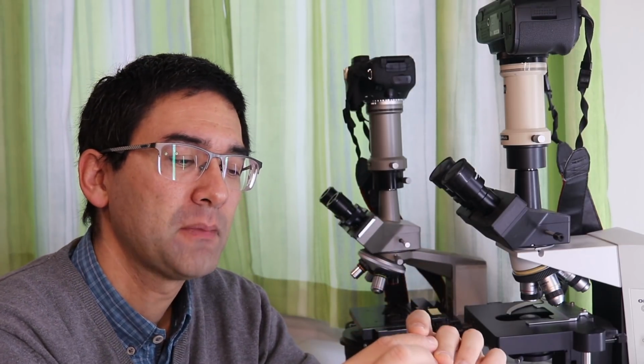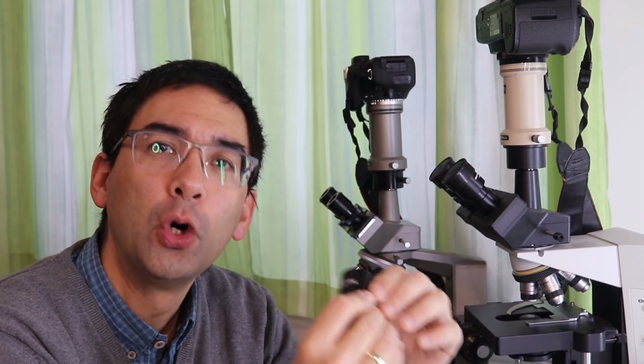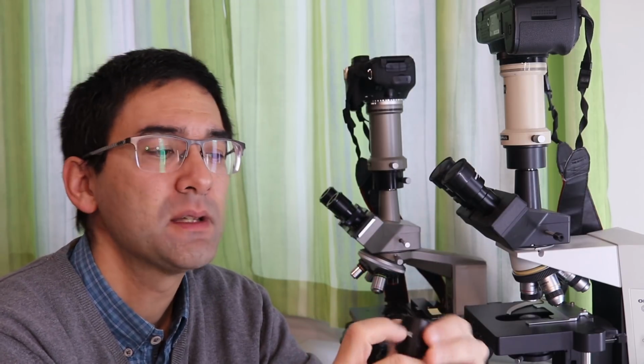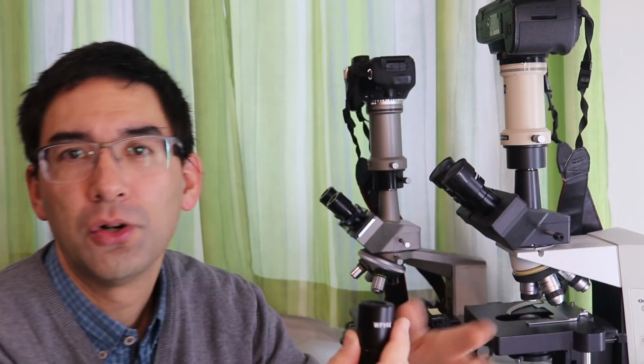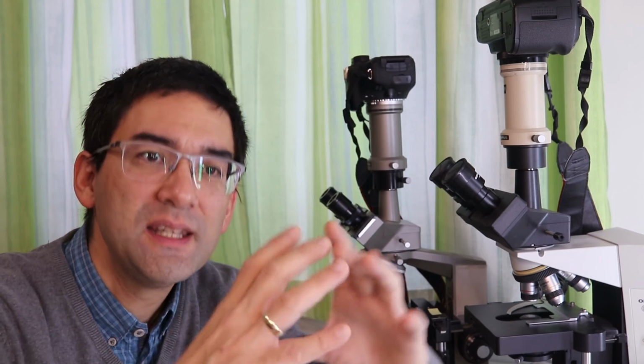The second thing is the so-called field number of the microscope, and this one is not always printed on the microscope. There are so-called wide field eyepieces, sometimes indicated with WF, and then there are also regular eyepieces, so to say. What is the difference? Basically, with eyepieces with a larger field number at a given magnification, you can simply see more.